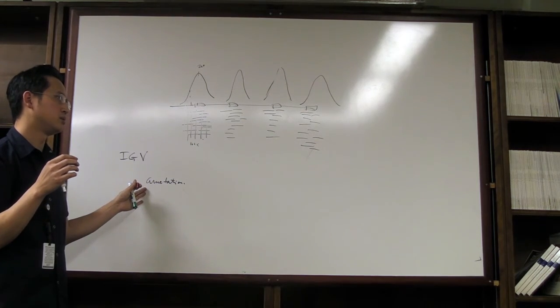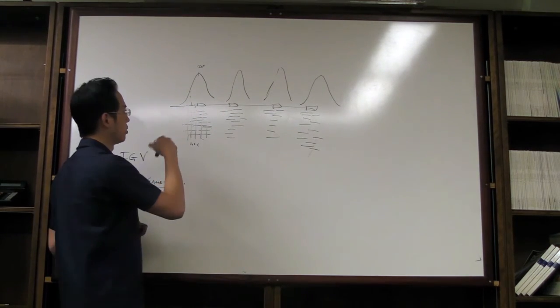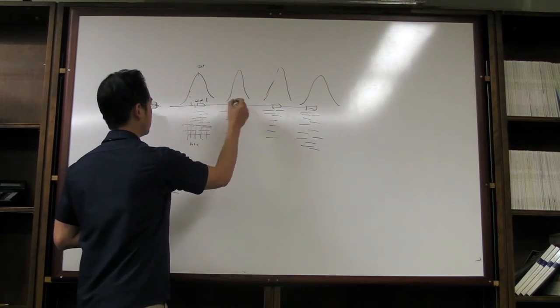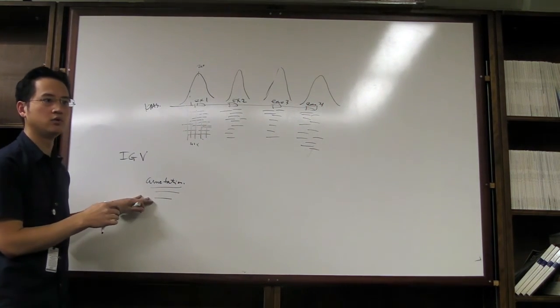I guess you could do this last, actually. You can do annotation up front if you wanted to. Let's just say that we annotate it. So what we annotate is that this is the KRAS gene, and this is exon 1, exon 2, exon 3, exon 4. There are free tools available that can give you the annotation.